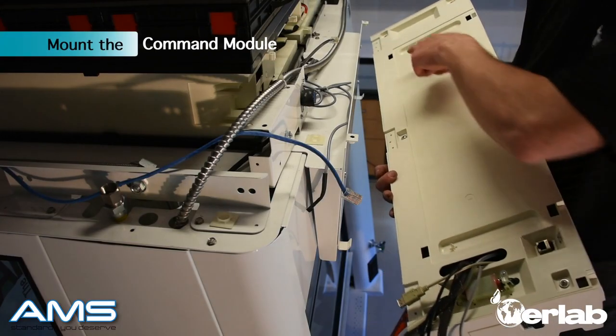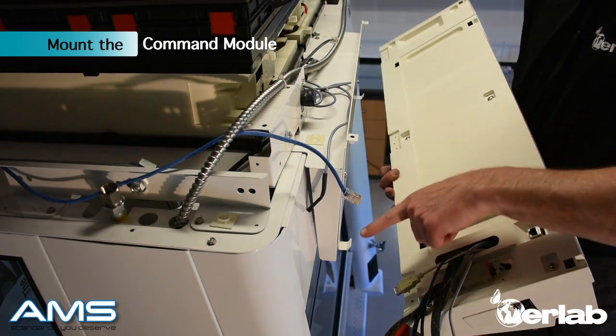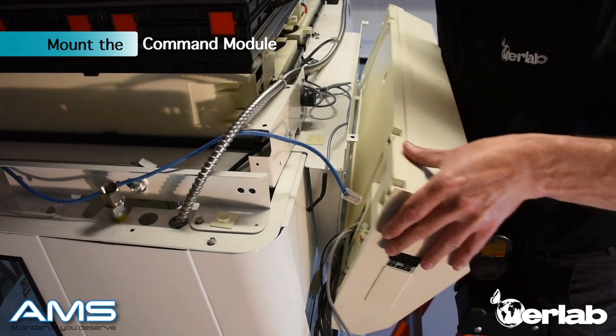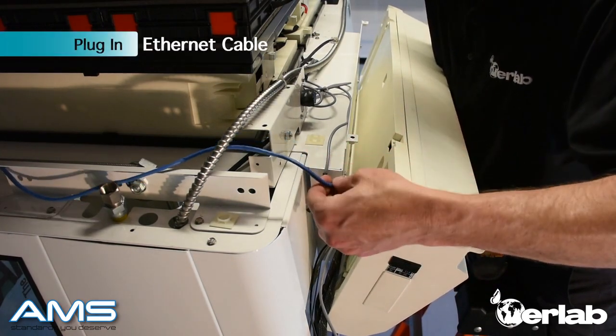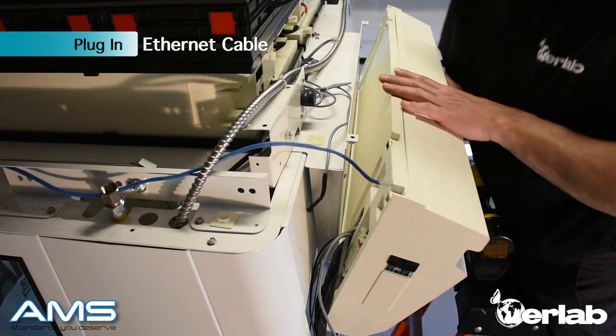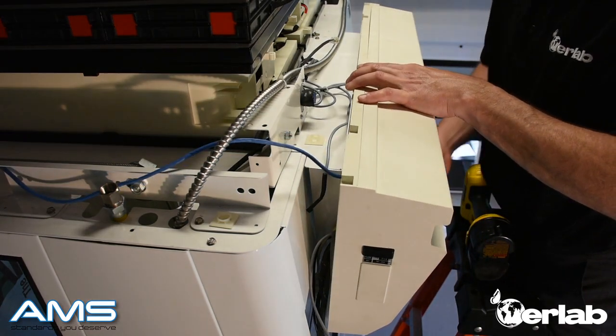There are two holes in the back of the command module and two hooks on the front of the fume hood. Line them up and place the hooks inside the holes of the module. Take your ethernet cable and make sure to plug that back in securely. With everything connected, press it back onto the hood.